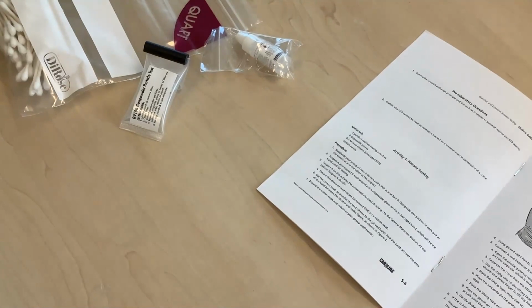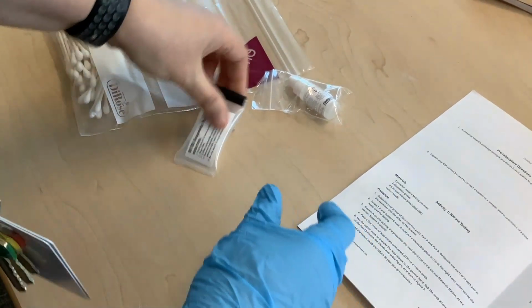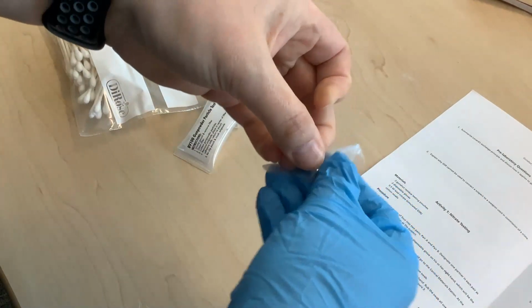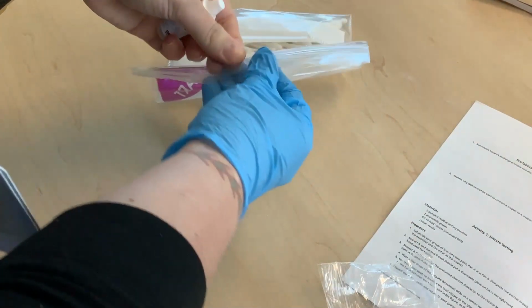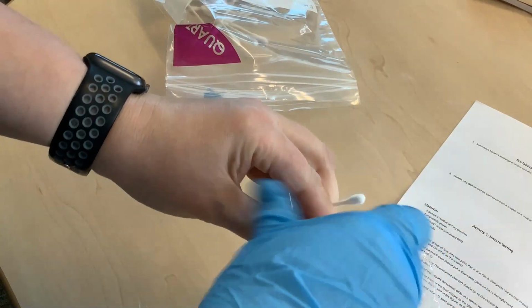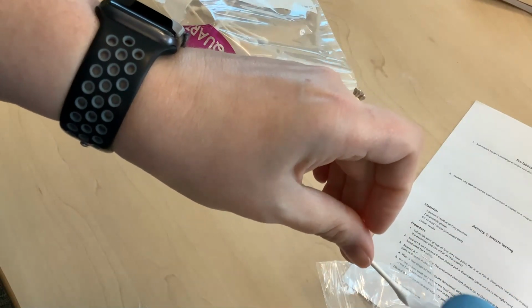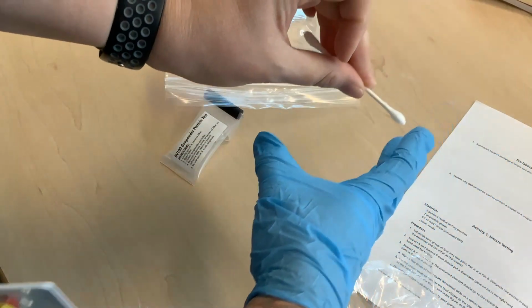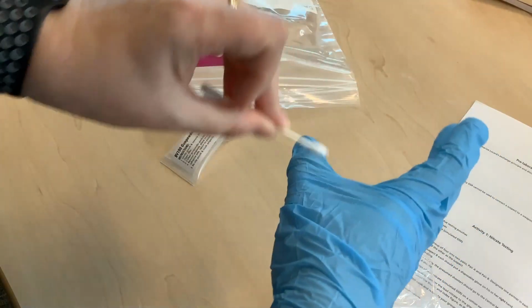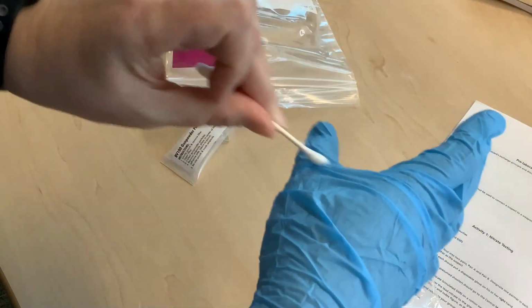So here's how we are going to set this up. I've got my nitrate solution, which I am going to very carefully remove. I need a Q-tip to do this with. Generally speaking, you can very gently and carefully put enough of the nitrate on there so that it's soaking into the Q-tip. And then I'm looking at my picture, and all the way down to there is where I am going to be putting my gunshot residue.